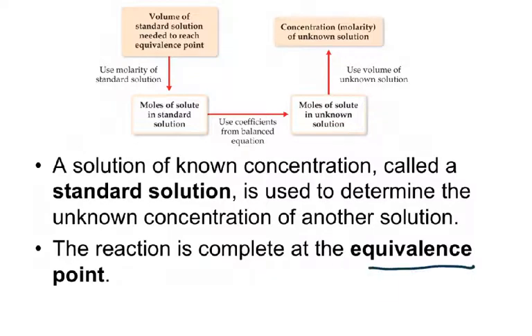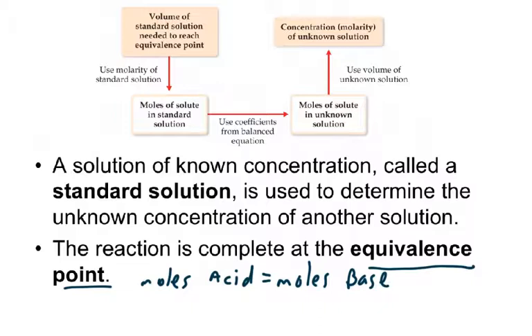The equivalence point is a very important definition because at that point, the moles of the acid are equal to the moles of the base, and you can do a calculation, as you could see at the top here of this flow chart, that involves solution stoichiometry to figure out the concentration of the unknown solution.